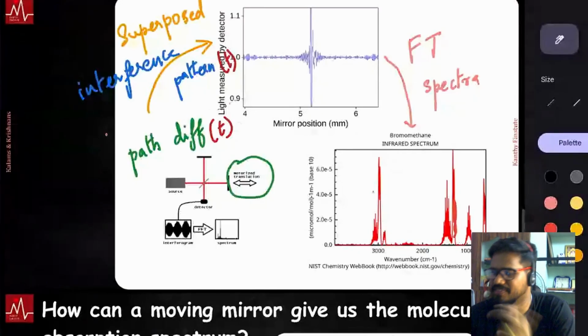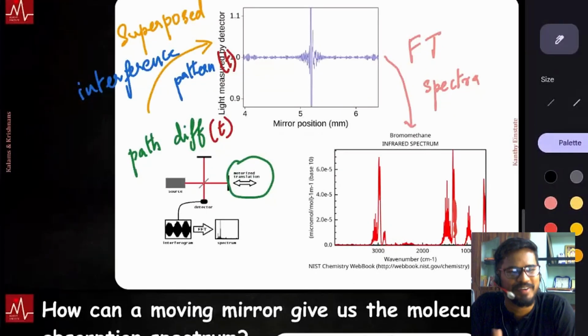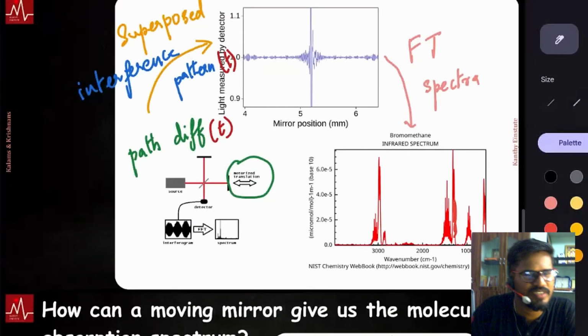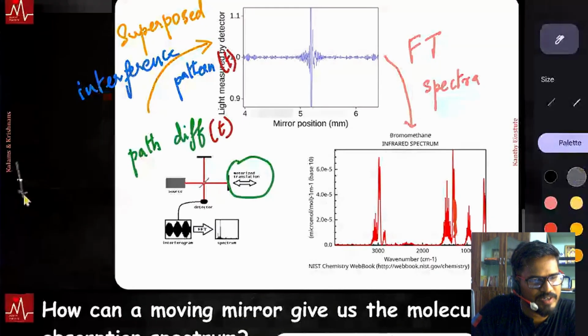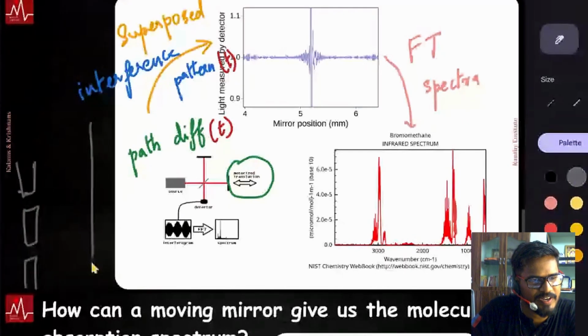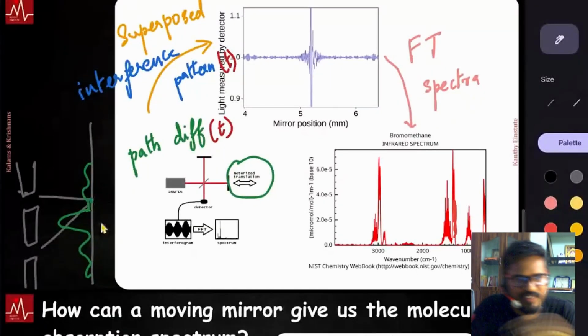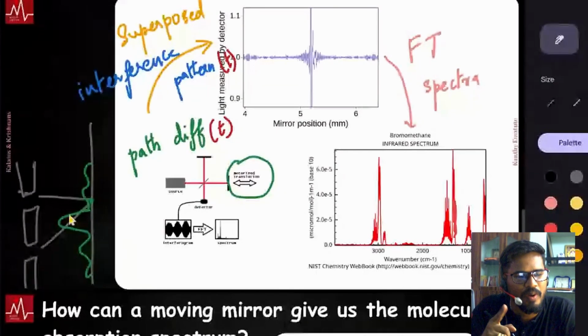Did anyone get the crux, or at least have a feel that something interesting is going on? Was there any spark? You got it a little. Hey, you know the double slit experiment. You have slit 1, you have slit 2. If you have a screen here, what arrives at it has a path difference, and based on that, there is an interference pattern. If you look at any point, there is a path difference; this all of you know.